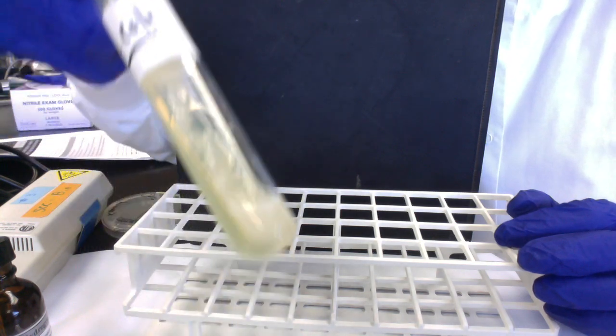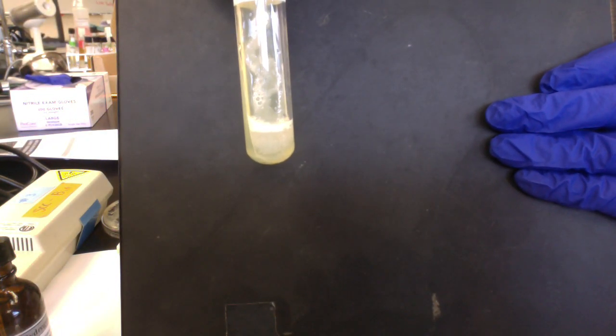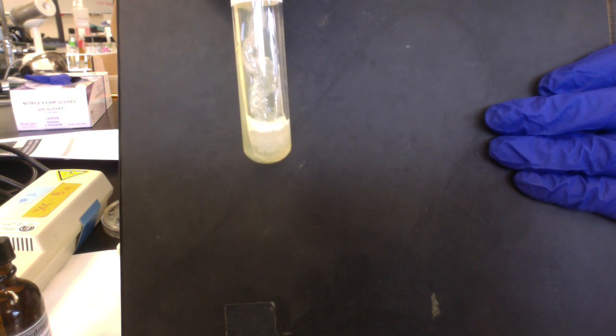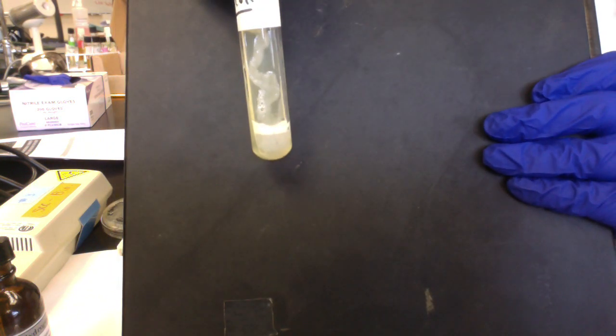Okay, there are bubbles, you guys. I know it's so disappointing. I'd like it to be a little bit more dramatic, but maybe we can see the bubbles developing there. We tried it on the staph epi on a slide catalase, and the staph epi culture was like 2 weeks old and was very weak. And again, folks, maybe you can't see it in person. This is not a bad catalase result. We can see those bubbles forming.